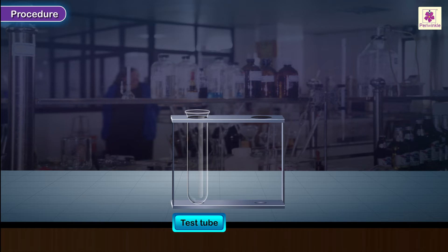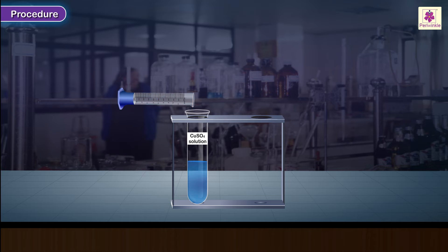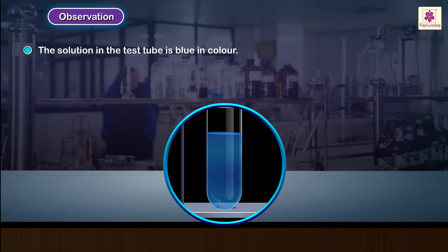Take a clean test tube labelled copper sulphate and take about 10 ml of copper sulphate solution in it. Observation: the solution in the test tube is blue in colour.